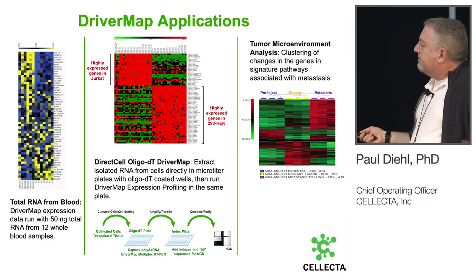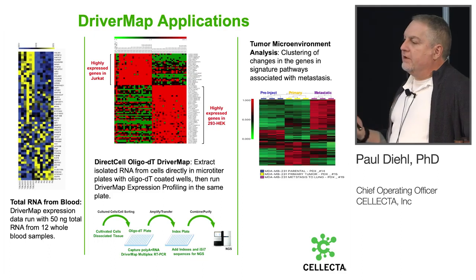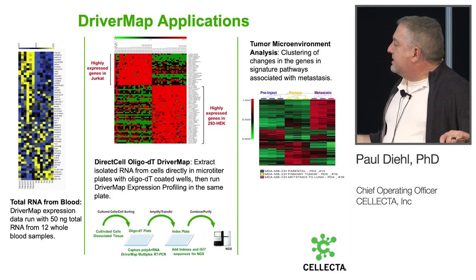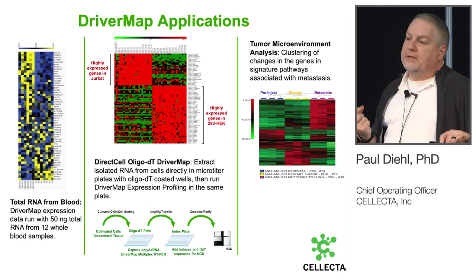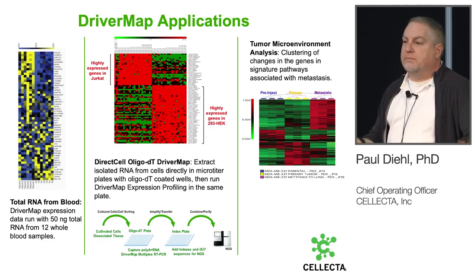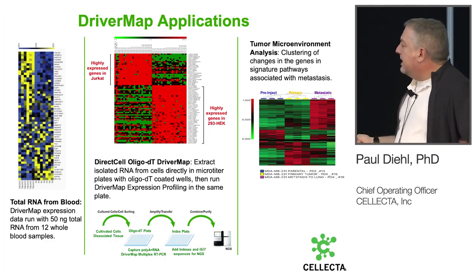And then we also have tumor microenvironment analysis where we're looking at pre-injected primary tumors and metastatic tumors in the xenograft. And again, this gives you the sensitivity, especially in working with small amounts of material, to be able to do this profiling. And the added feature is that this is in a mouse system. So we're looking at human cell lines that have been injected into the mouse, and that's the primary cells, and then the metastatic tumors. But the metastatic tumors are very tiny, and we took the whole lung and did the profiling. And because it's a targeted system that's specific, you don't have the amplification of the mouse genes in the background. You're really only amplifying the human genes. So we're looking specifically at the human profile. So for a mixed system like that, it actually has some advantages.